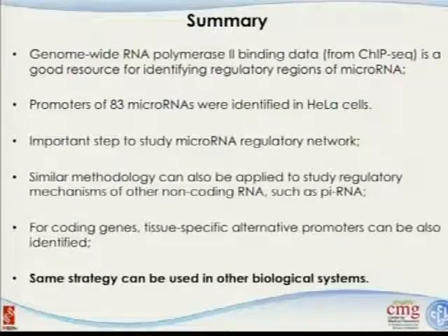And the second part, which is the RNA polymerase II part, people didn't try to develop too many methodologies to use this type of data. I think this is one of the attempts, and there are not too many available, to use the ChIP-seq data on RNA polymerase II to study gene regulation. And the third part, which we'll talk about later, is the epigenetics part. Again, there are a lot of significant efforts that need to be done in terms of improving the computational strategies.